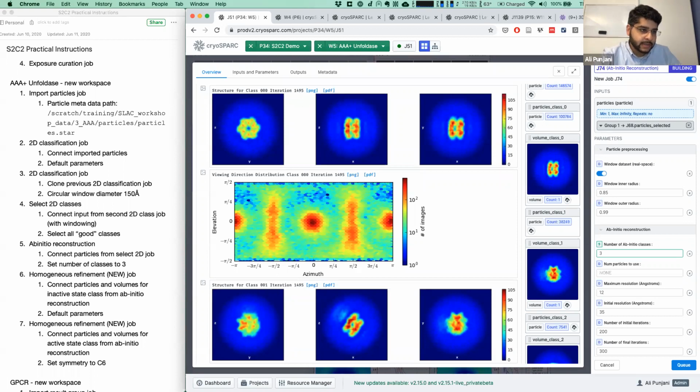That's something that can be handled in other ways, for example, with 3D variability using a mask. We'll talk about that later. But there isn't anything particularly special, I would say, that you have to do in ab initio reconstruction. If you are seeing conformational differences that are just in the micelle, and you want to force the algorithm to look for smaller changes that may be in the protein, you can of course increase that score. But it's not generically true that that will always actually do better when the micelle is present.